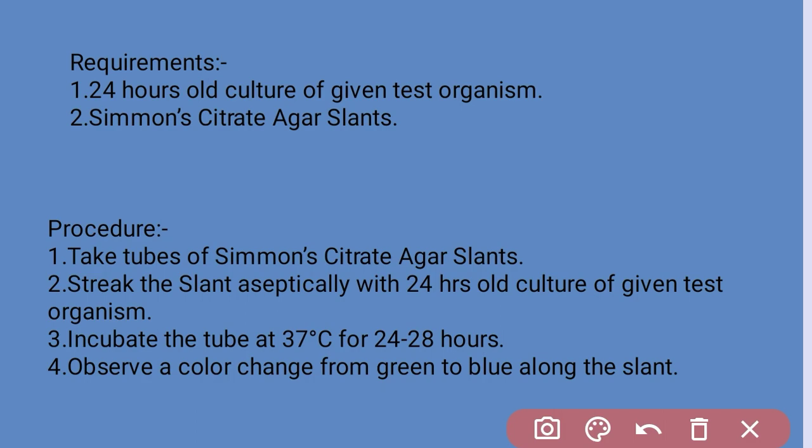If the organism grows in Koser's citrate medium, it is taken that the organism has the ability to produce the enzyme citrate permease and hence grows in the medium, and after growth turbidity will be there. Turbidity shows a positive test, whereas no turbidity in Koser's citrate medium shows the test is negative.